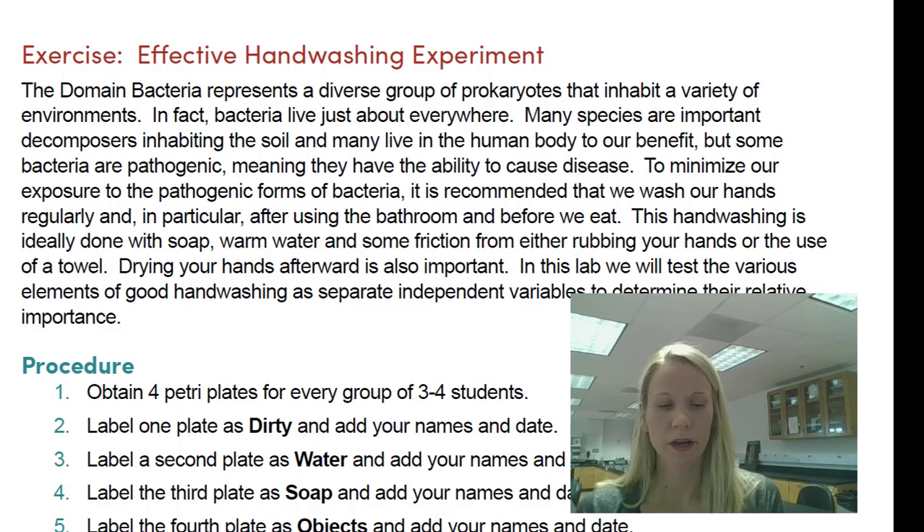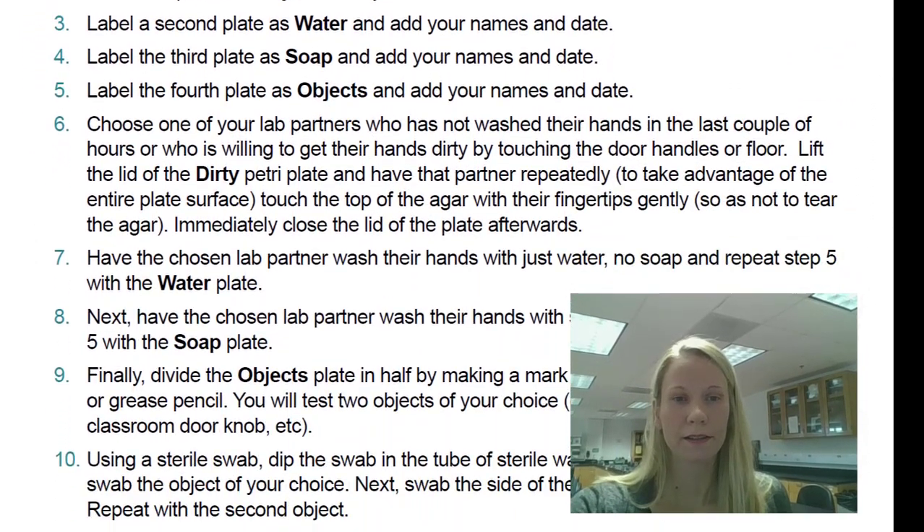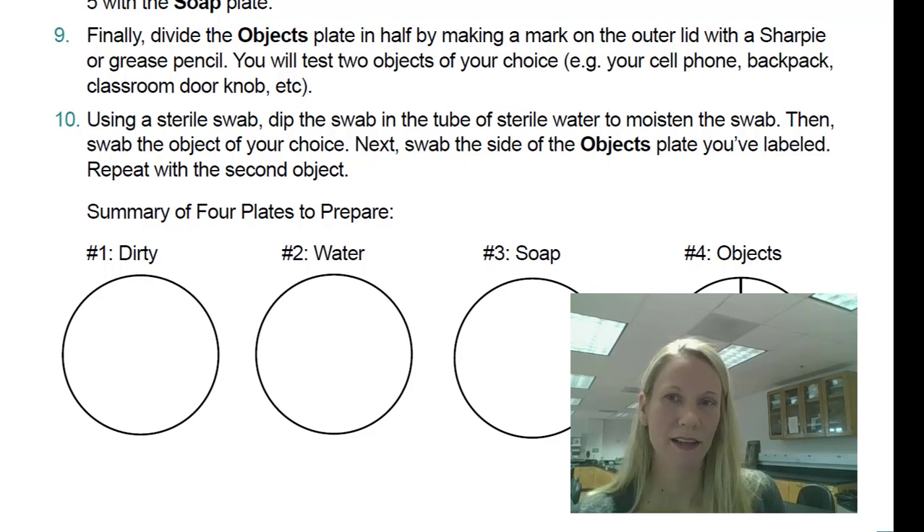What we're going to do here is culture bacteria in petri dishes. These are petri dishes that contain a nutrient source called agar. Looking at the lab manual, it says we're going to have four plates — a summary of four plates at the bottom of page 151. We're going to have a dirty plate with dirty hands. Then I'm going to wash my hands with water only, then with soap and water. I also threw in an additional plate — I'm going to wash my hands with alcohol-based hand sanitizer. And then we're going to divide a plate in half and test two objects to get the results.